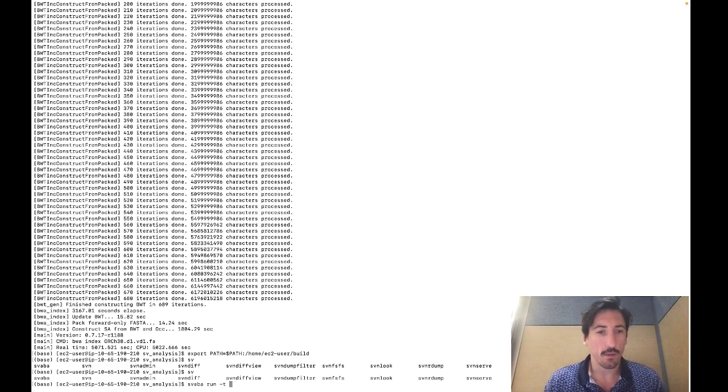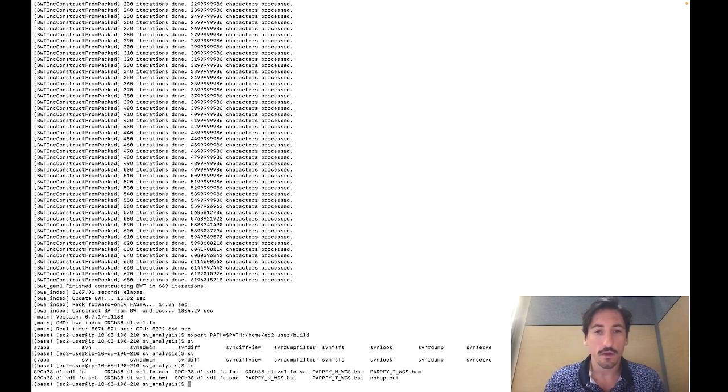And then we provide, oh, let me pull up the, yeah, here are the file names so I can copy and paste. I like to copy and paste file names just so I don't screw anything up with the typing. But here we just do T and provide the tumor file. Here we provide, for the N option, the normal whole genome file.